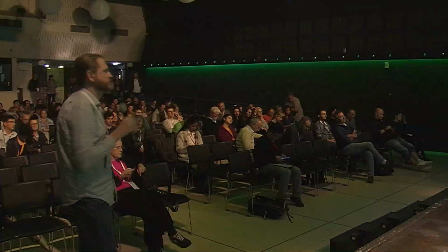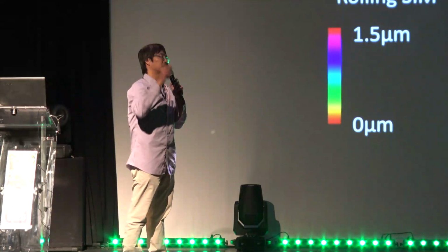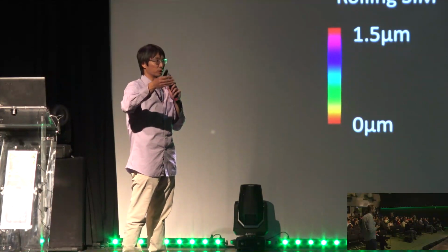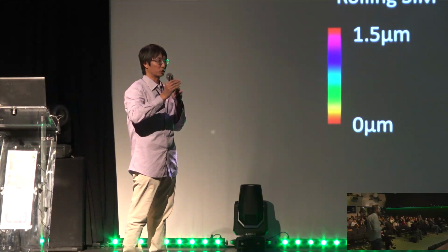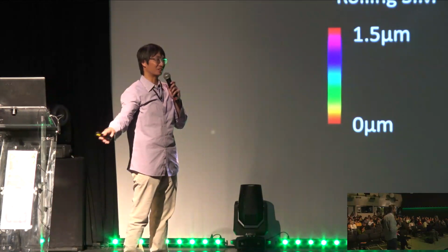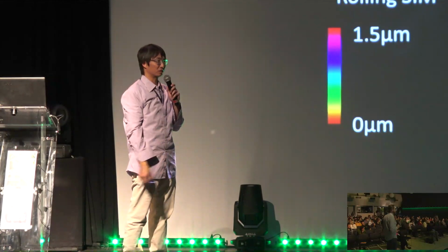No, there is no limitation. The field of view is limited by basically your camera. So whatever you can image with your camera, you can shear. Of course, you cannot shear to plus or minus 90 degrees, but within that range, it's all possible.